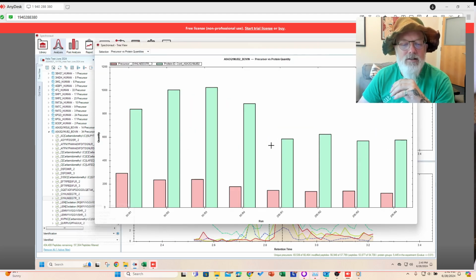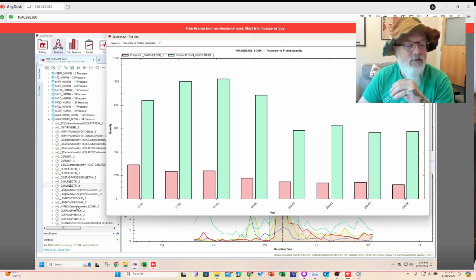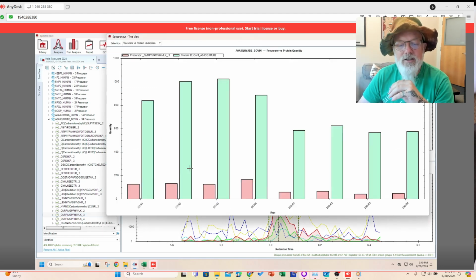This is a little better. For whatever reason, it is normalizing these. Where did it go? It all kind of looks like there's more in the 50s and the 200s, right? It's probably a normalization artifact. Maybe we could see if we can fix that. But let's not try and fix it for now.